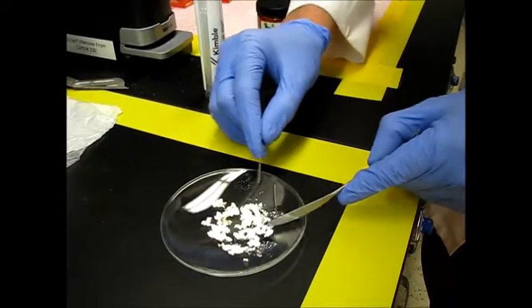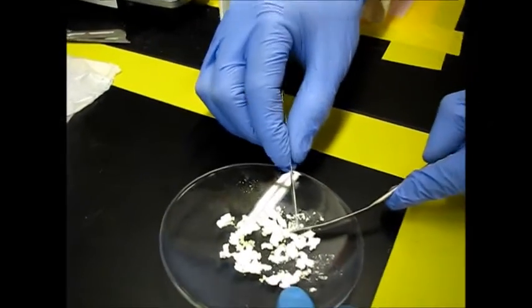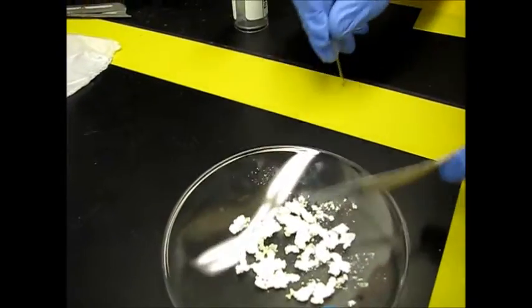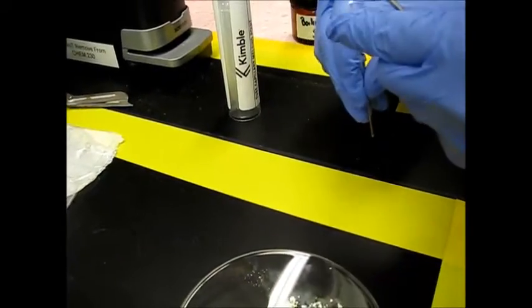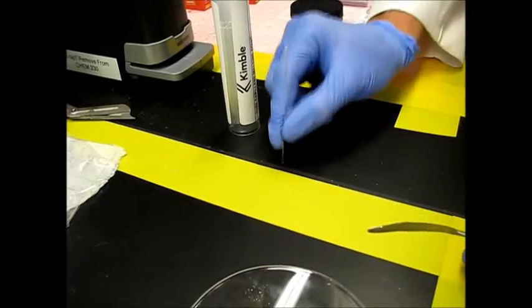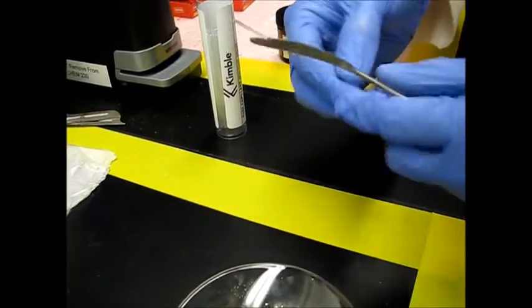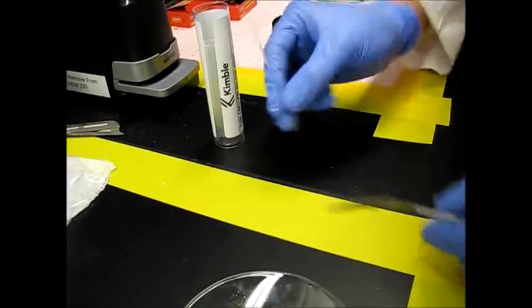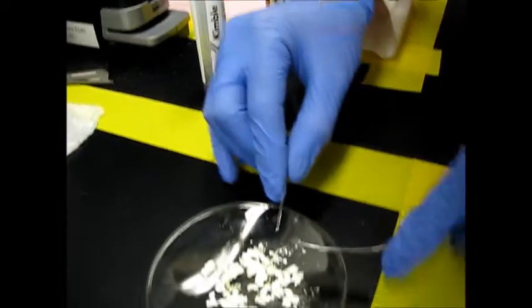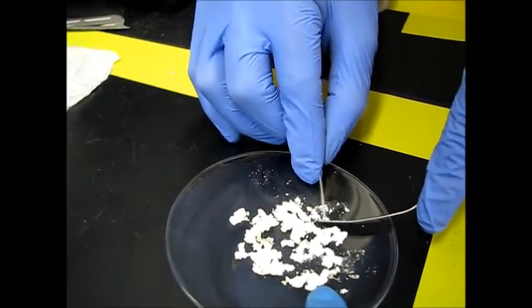It might be easy to have it like this so that you can actually press it in. Once you get a little bit in, you want to tap it in. And then you want to scoop a couple more times just so that you get a good amount of product into your capillary tube.